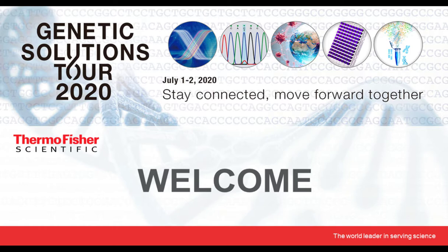Emily is the R&D scientist for sample preparation bioscience at Thermo Fisher Scientific. She has worked as a part of R&D for over 15 years and has contributed to multiple projects for a wide range of sample types, library preparation for sequencing, and purification and analysis of exosomes. Harita is the Senior Product Application Scientist for the Genetic Sciences Division of Thermo Fisher Scientific. She has over 10 years of experience in product development on real-time PCR assays for gene expression and microRNA analysis. Today, they will be talking to us about how to identify stably expressed microRNAs and the workflow to identify normalizers in serum and plasma using TaqMan array cards, plates, and OpenArray.